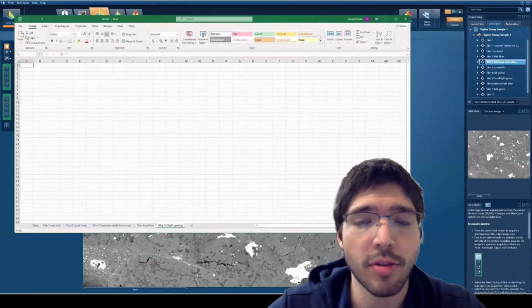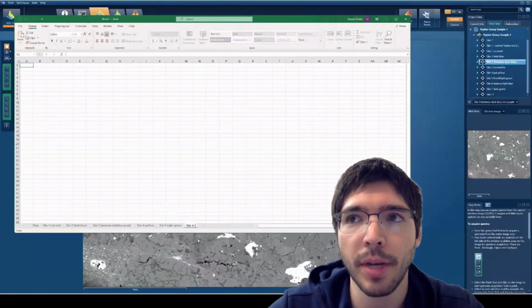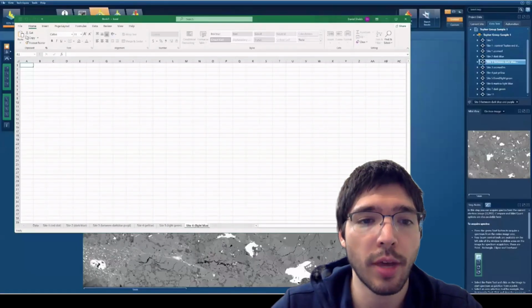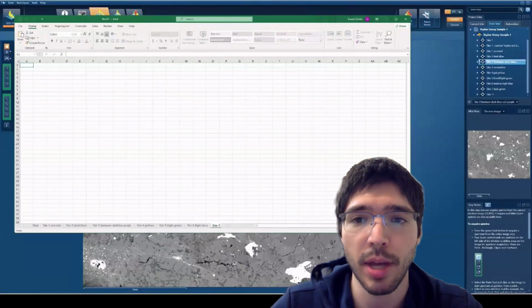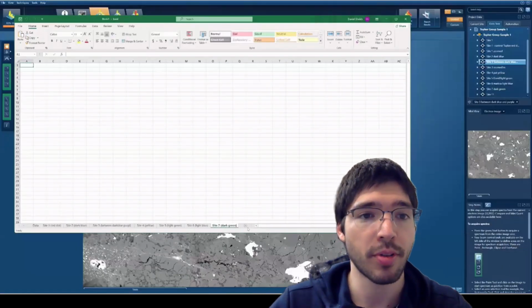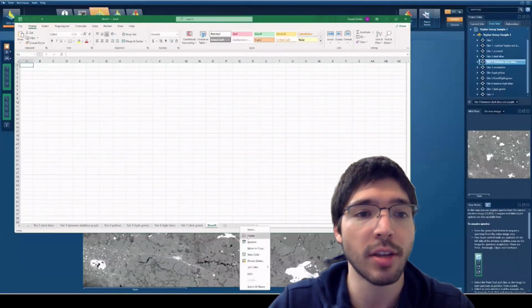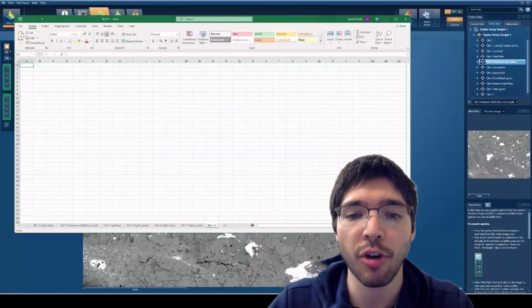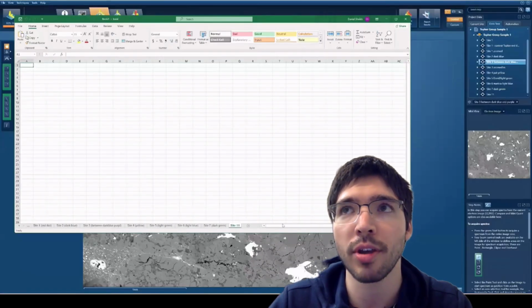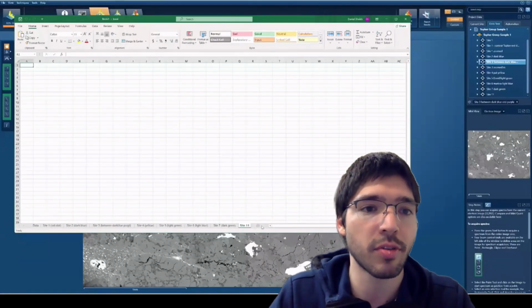Yeah, that's a great question. The oxide percent is very important, but it's not as important in data collection using the EDS as it is with the electron microprobe. Ideally, in a perfect world, you want all your totals to add up to 100%. But in some cases you don't get exactly 100%. You sometimes get 99.5, or sometimes 100.4. With the electron microprobe, ideally you want totals anywhere from 98 to 102%, with the best being the ones closest to 100.